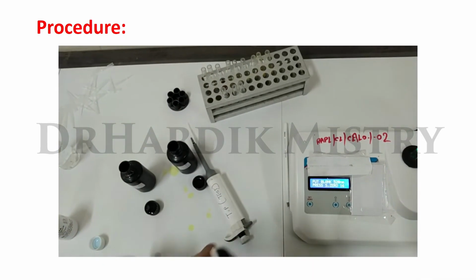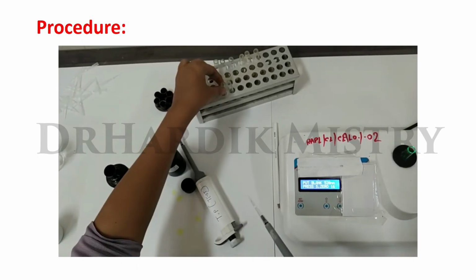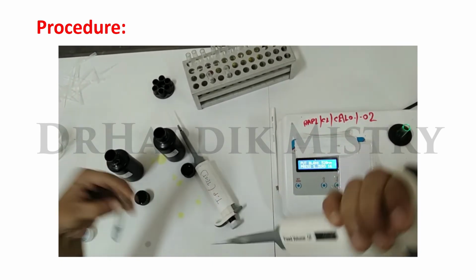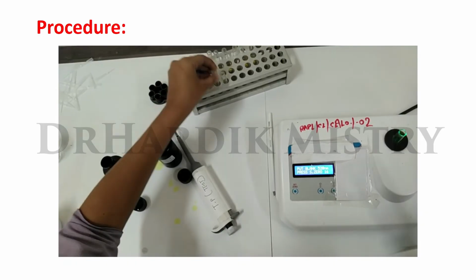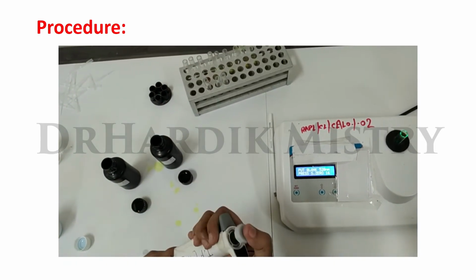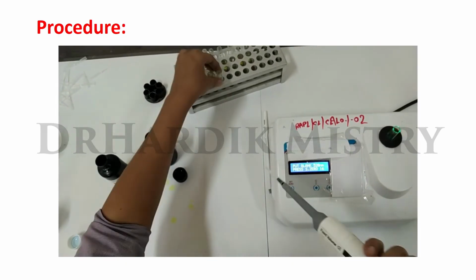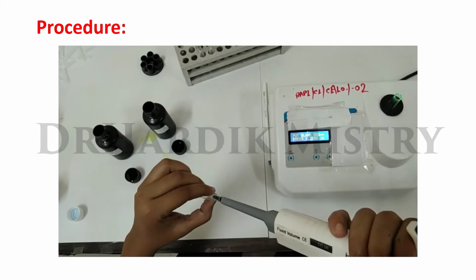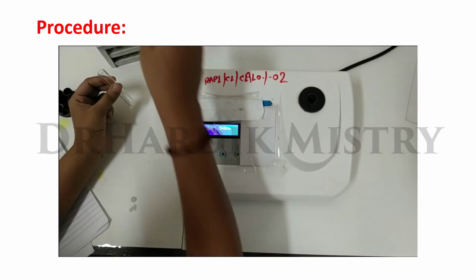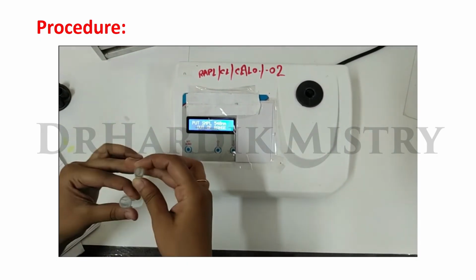Add 10 microliter of standard solution in the standard test tube. Add 10 microliter of the serum sample in the test tube. Mix well all 3 test tubes and incubate at room temperature for 5 minutes. After 5 minutes, take the reading colorimetrically at wavelength of 540 nanometer.